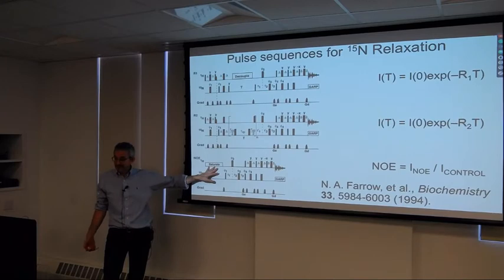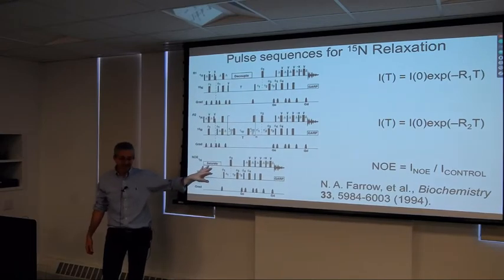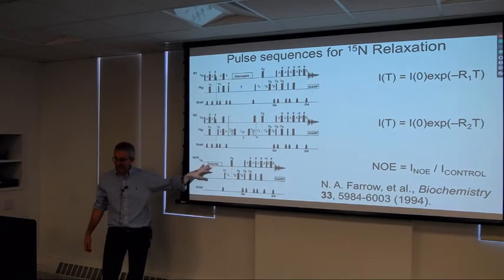But even if you said 5 seconds, that's longer than you're usually leaving. Most of the time you're running just an HSQC, the recycle delay might be 1.5 seconds, it might be 1 second. You're not getting anywhere near Boltzmann equilibrium, but you get enough recovery, you're happy to collect the next transient. But here you really have to wait.